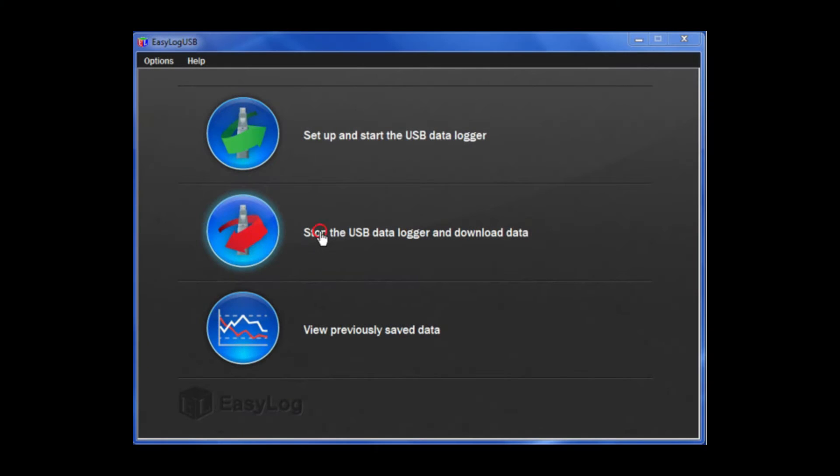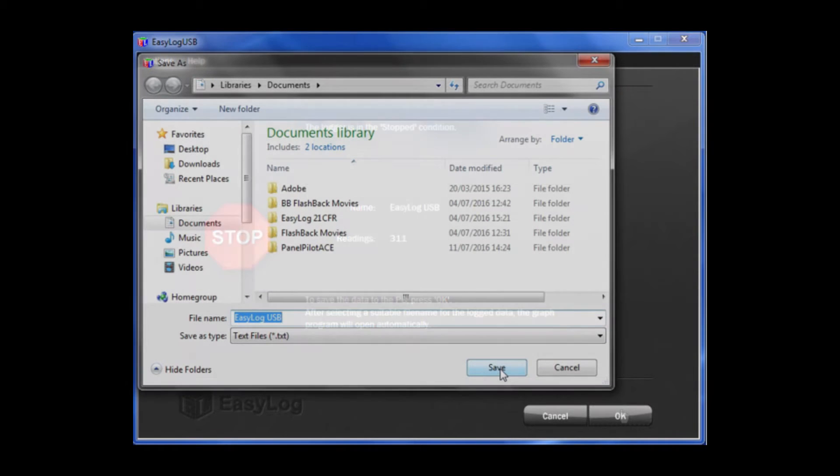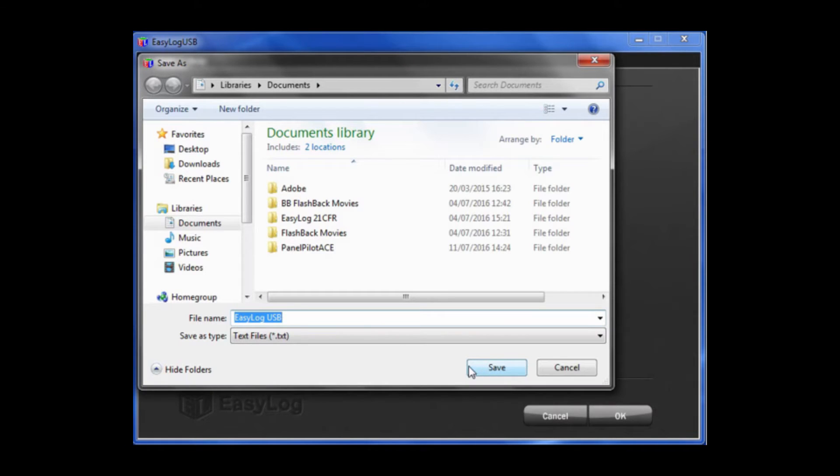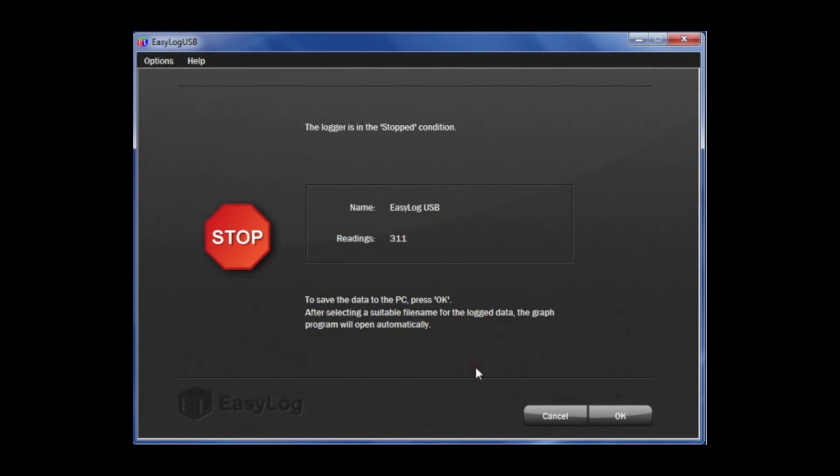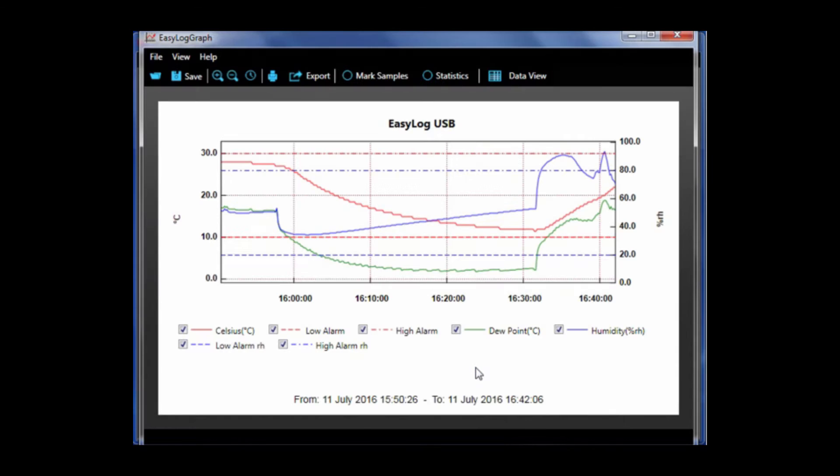To begin, click stop the USB data logger and download data. This will bring you to the logger stop condition page. To save the data, press OK. Next you have to select a file name for the log data then click save. Then the graph program will open automatically.